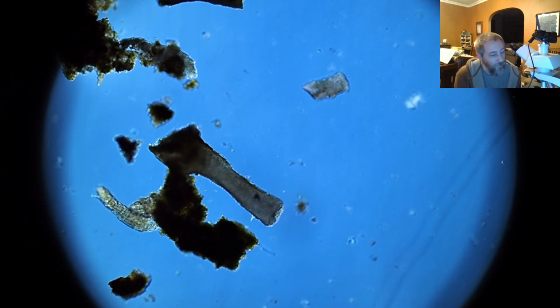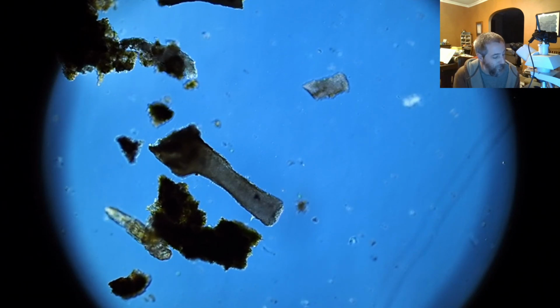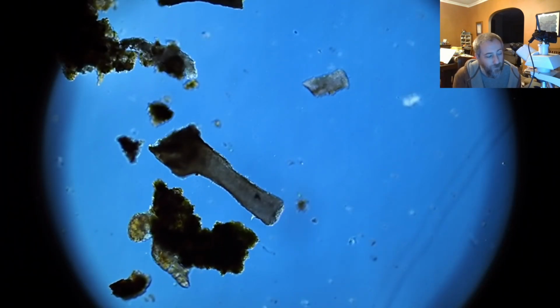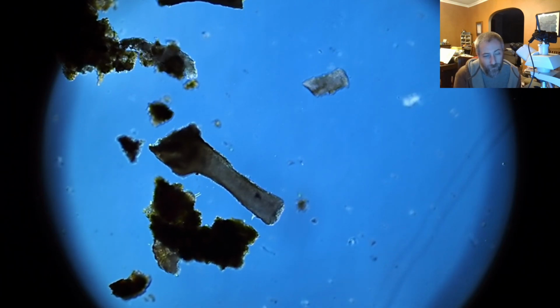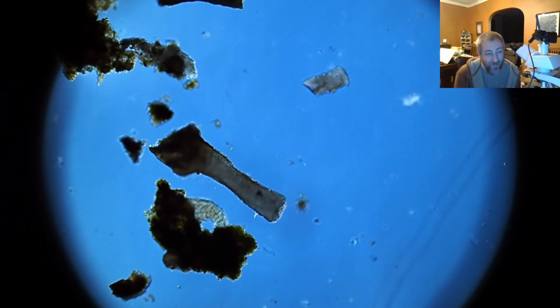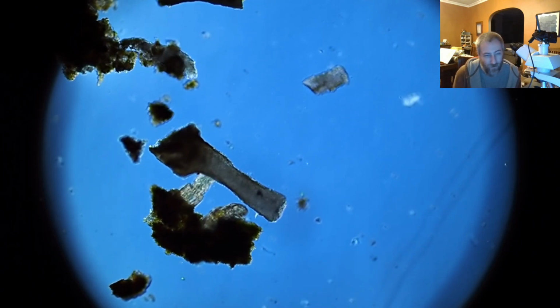And then with the fancy software that we have, and the camera mount at the top, and this one's got filters on the bottom. I can sort of flip the filters around, and the differential interference contrast and phase contrast filters, which we use mostly for diatom stuff. I think this one costs something like $28,000. So that's the total thing with the computer and the software and everything else.